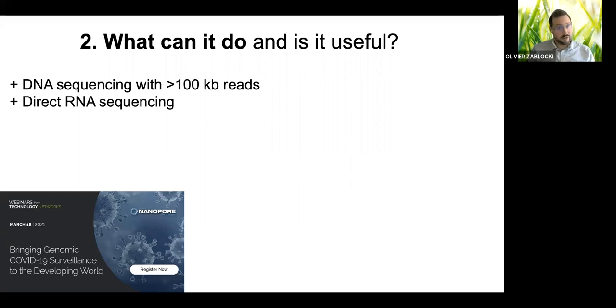This can be particularly interesting when you want to sequence RNA viruses or transcripts that perhaps have epigenetic modifications. So these are essentially bases that have been modified and have some biological functions, for example, in terms of DNA protection with methylated bases. The technology allows you to recognize the electric signal of modified bases directly, either on DNA or RNA.